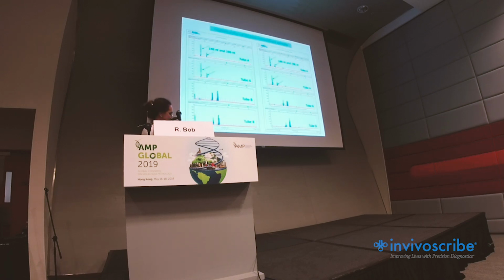The reason you have for Ig kappa tube A is that in more than 90% of cases, there are always these two peaks at 150 and 200 base pair, or 146 and 196 NT.